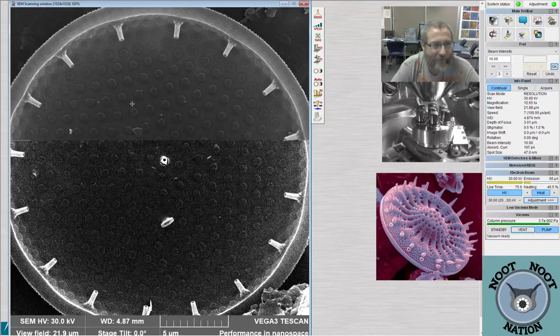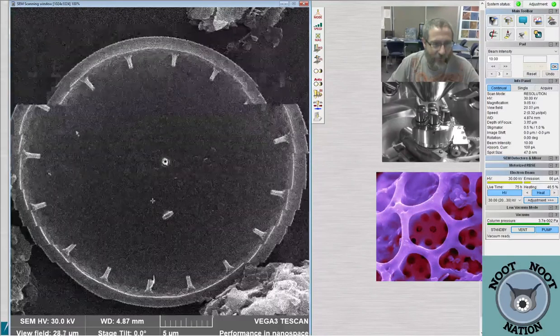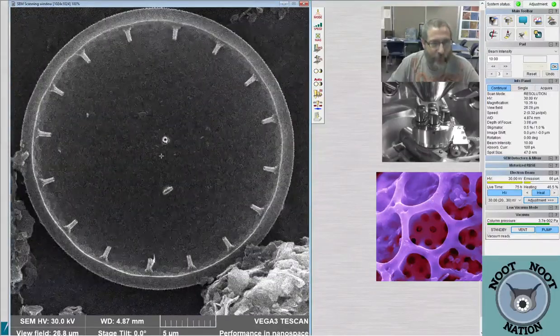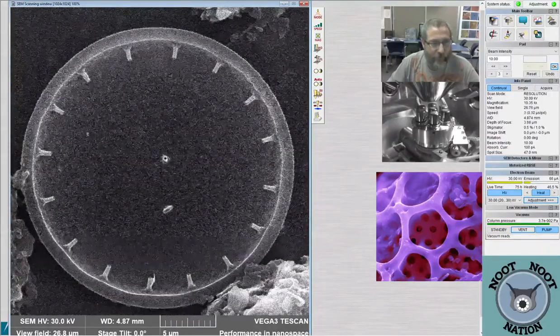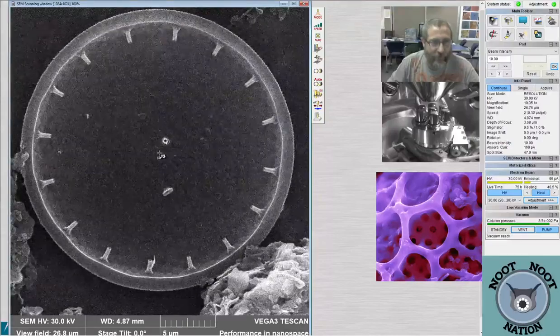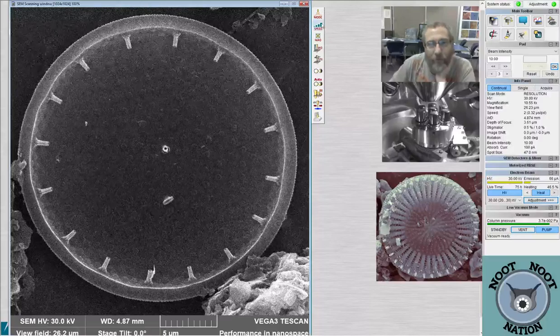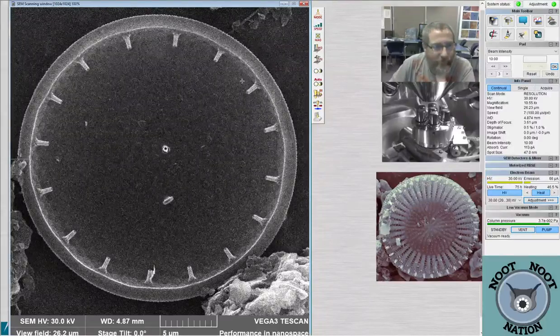That's just weird. Yeah. So it's not a Thalassiosira, at least as far as normal Thalassiosira would be considered. But I don't know what it is. So we should ask Anna. This is an Anna question, or maybe my friend Andy, somebody who's used to looking at these things.